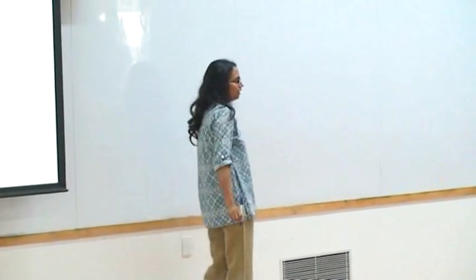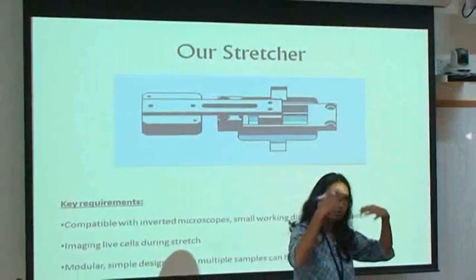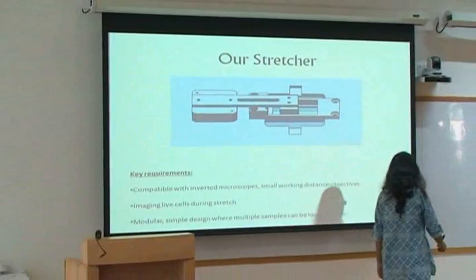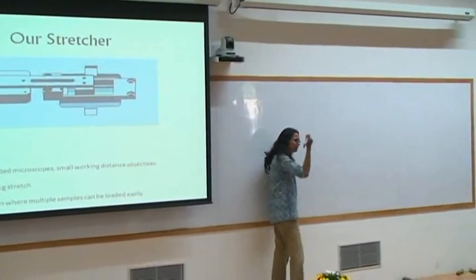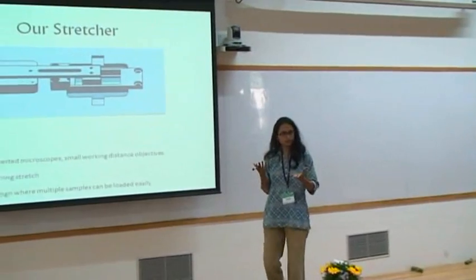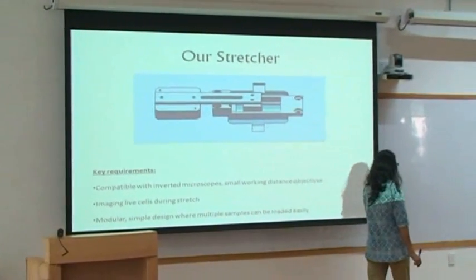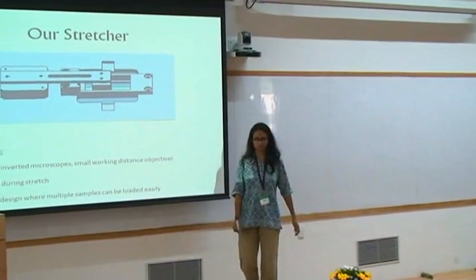The evaporation here, we have not really quantified it, but overnight you do not lose your 50 microliter of fluid. If you just keep 50 microliter fluid outside, you definitely dry. But over the time scale of the experiment, our experimental time scales are 1 hour, so therefore the loss is even less. Actually not less, it could be more because you don't have the humid environment. So what you can do there is we put up a little drop of mineral oil which can cover the top and stop evaporation. For a matter of an hour, it should be fine. I don't think the oil would start interacting with the membrane or anything, but this part really is tricky.